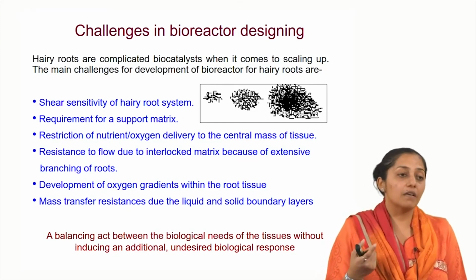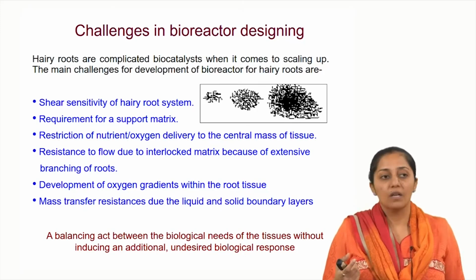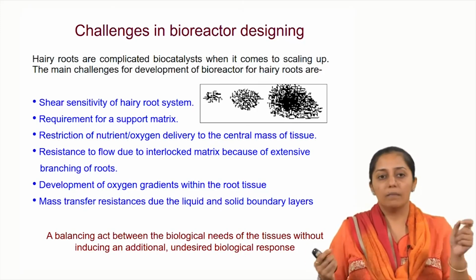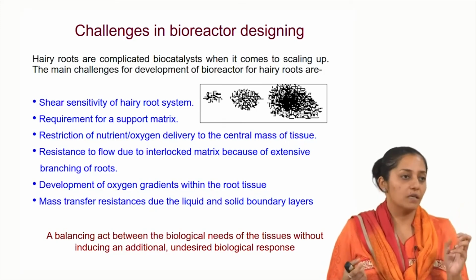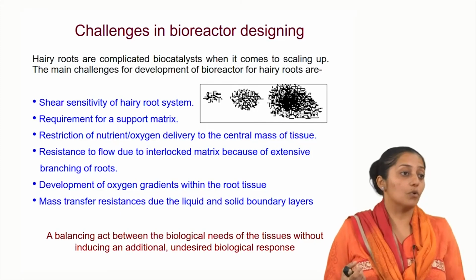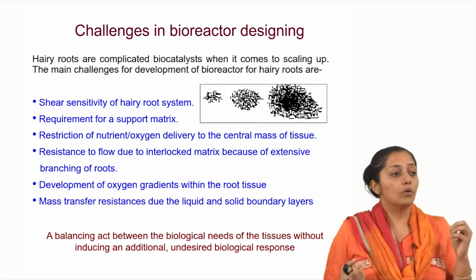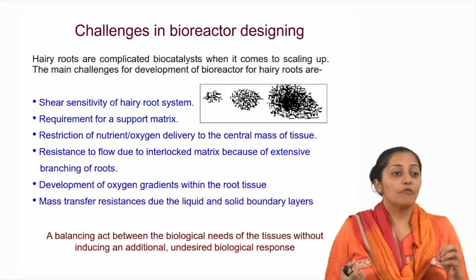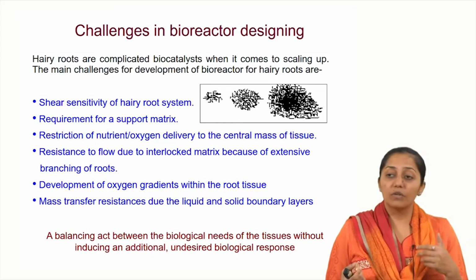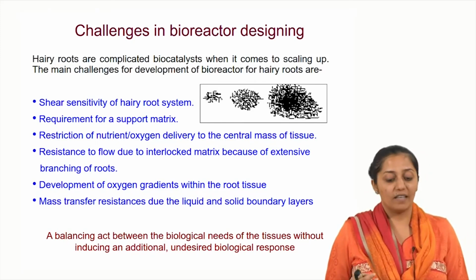Like when we were working with Azadirachta indica, initially when hairy roots were induced, it was like a taproot system. There was one single root and then branch, and the branching was also less. So it was very difficult to do liquid culture of those roots. Growth rates were very slow. So we had to optimize the media, and then we applied gibberellic acid as one of the hormones, and we could clearly see the morphology completely changed to the picture like this.